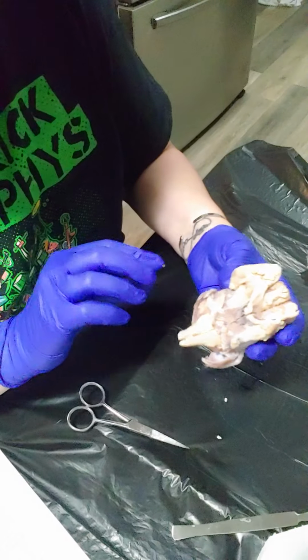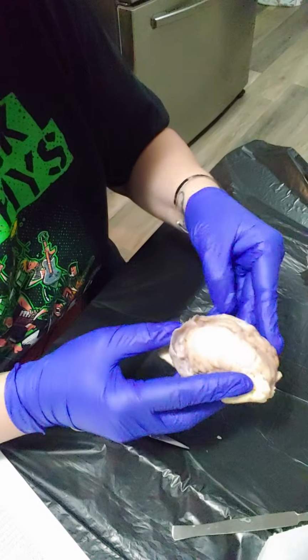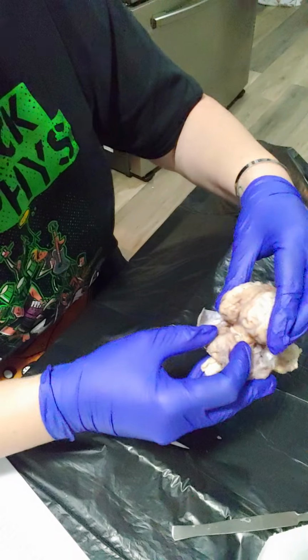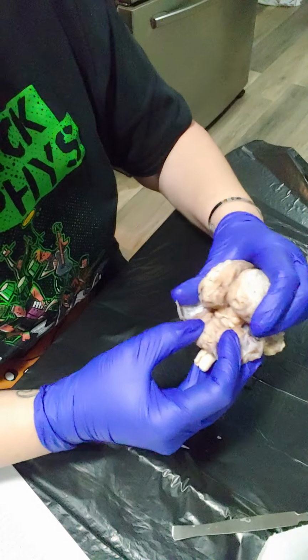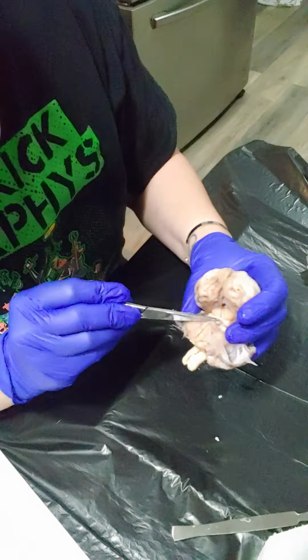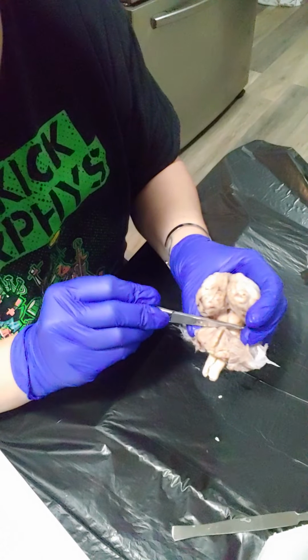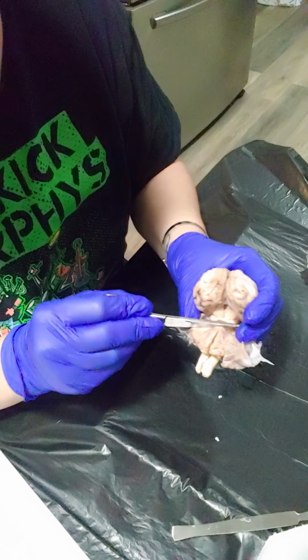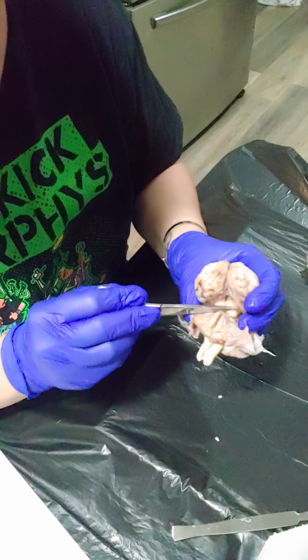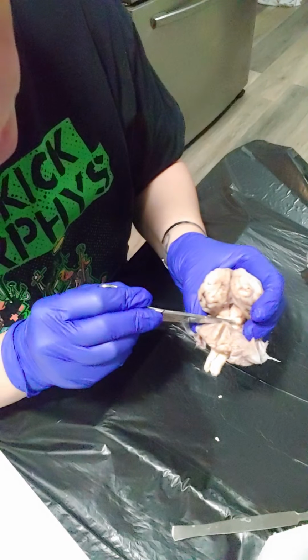Okay, your corpora quadrigemina. Yeah, that word. So if you flip it back over and we kind of separate the hemispheres from the cerebellum, this structure here, all four parts, is your corpora quadrigemina. It consists of two superior lobes, or superior colliculi, and inferior, which are just below, a little bit smaller.